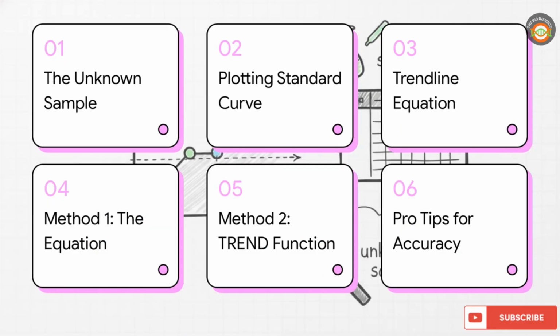So here is our roadmap for today. We'll start with the unknown sample mystery, move on to plotting your standard curve, then unlocking the trendline equation. After that, we'll cover method 1, which is the equation, followed by method 2, the trend function, and finally, we'll wrap up with some pro tips for accurate results.